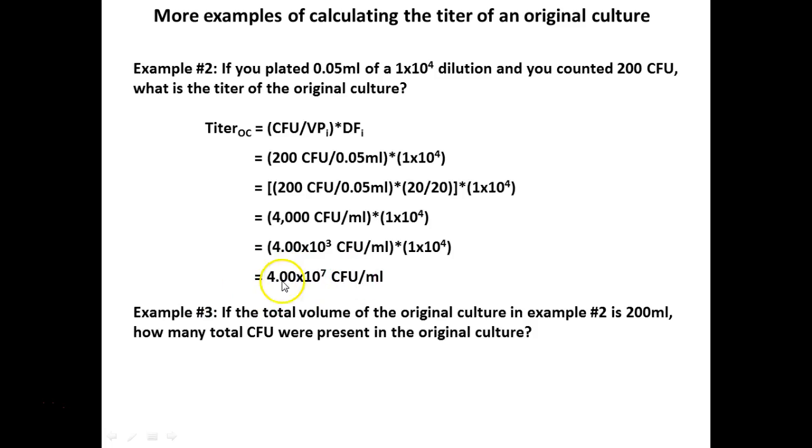Once we have that concentration, we can calculate about how many CFUs there are. We say CFU because it stands for colony forming units, because it could have been more than a single cell that made that colony. So we can't say cells. We don't know for a fact that it was a cell. So we say colony forming units.